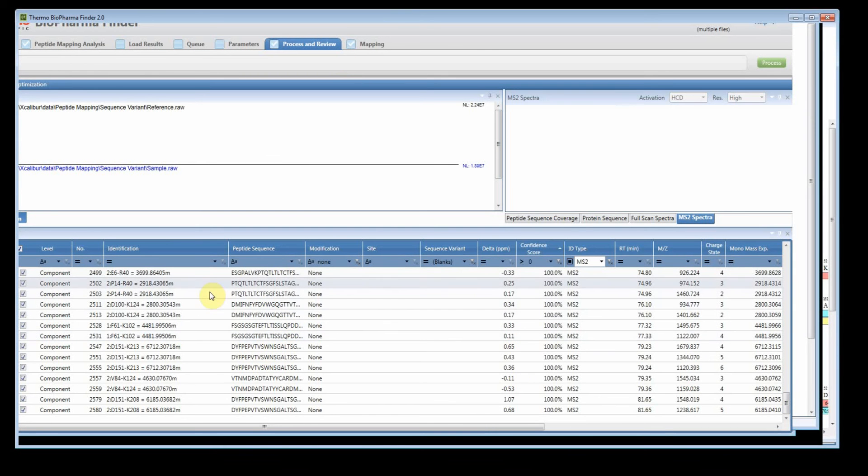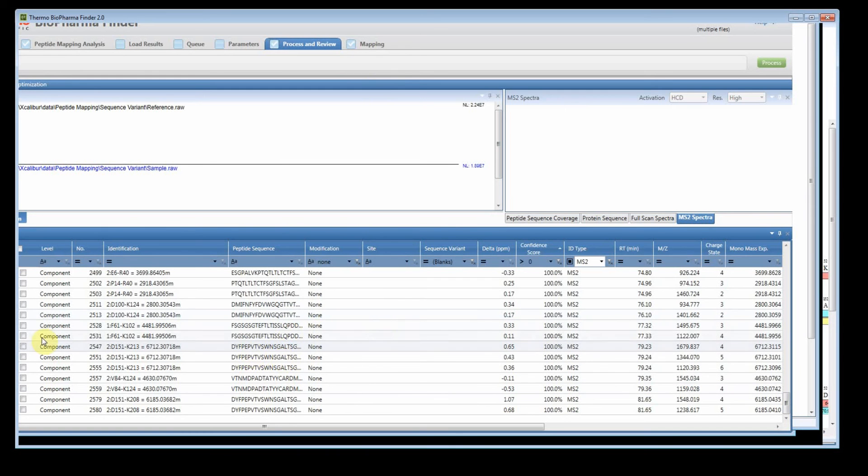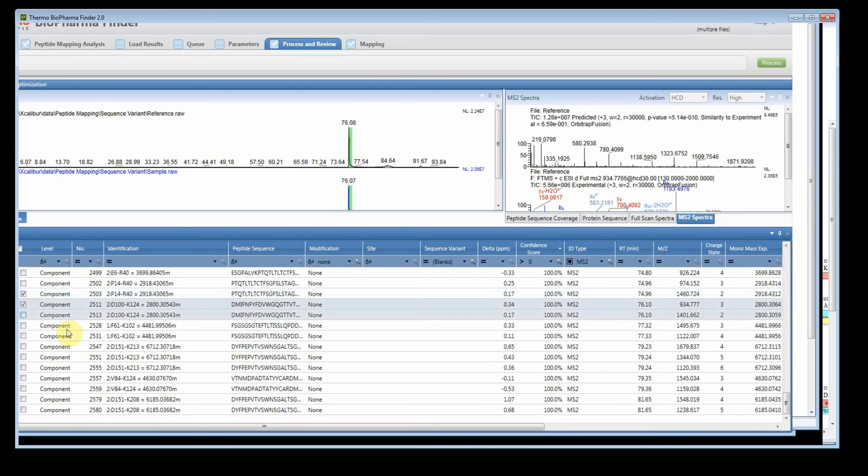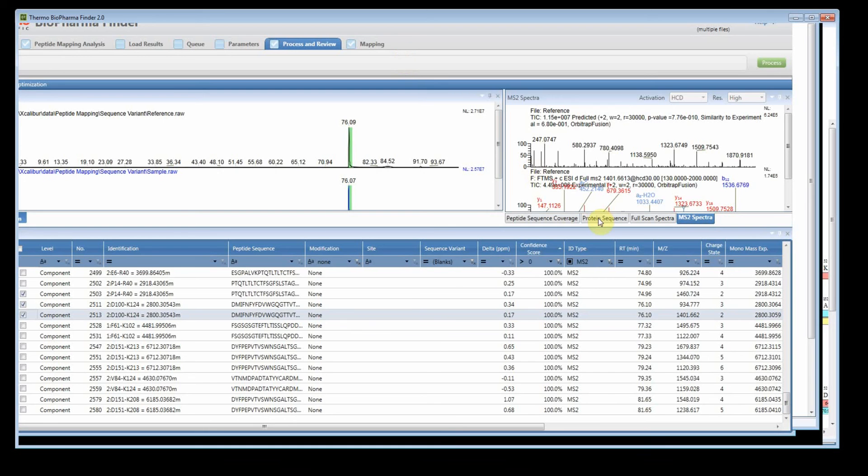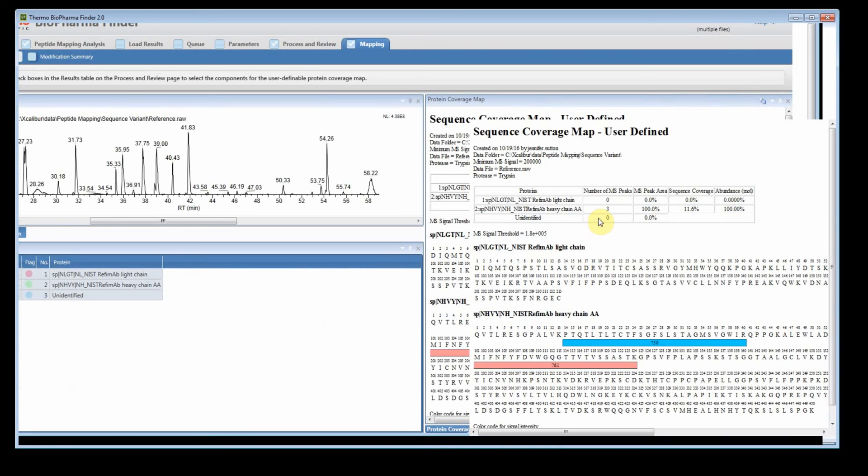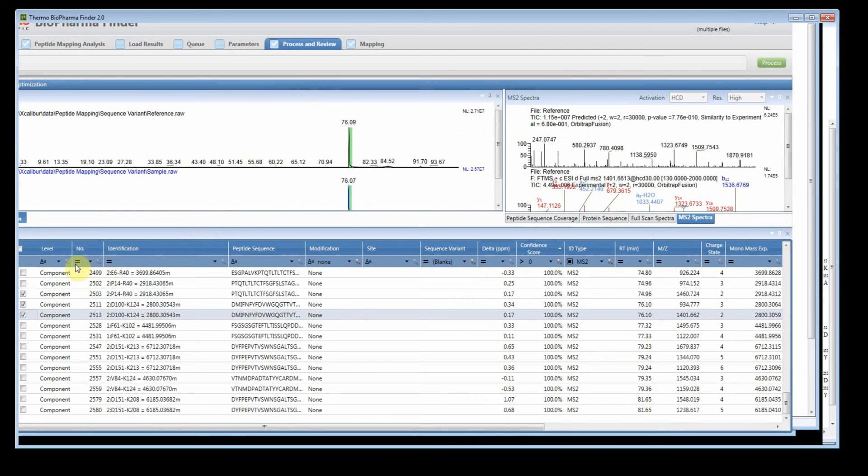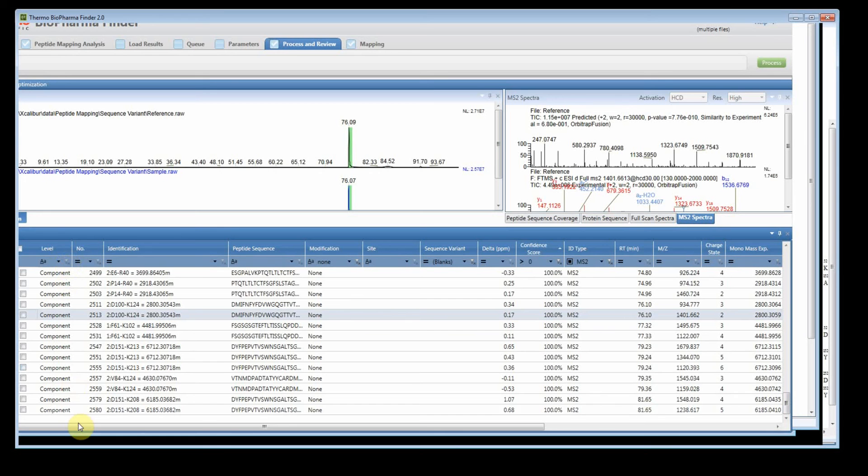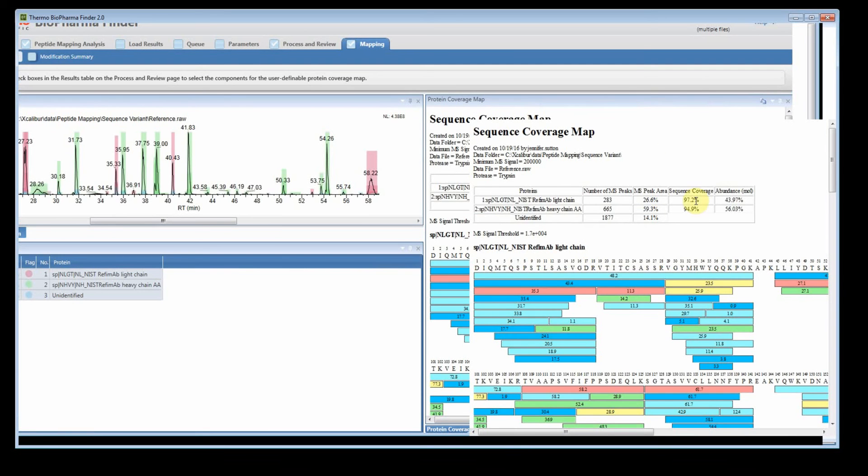And again, you control that by using the check boxes on the process and review page. Filter the table however you want to filter it. Whatever you have checked, even if it's just one or two components, and you go back to the mapping, that's what you'll see on your coverage map and in the shading plot. And to reset it, you uncheck and then uncheck. So if no components are checked and you go back to the mapping, you'll actually see that you get back to your original plot.